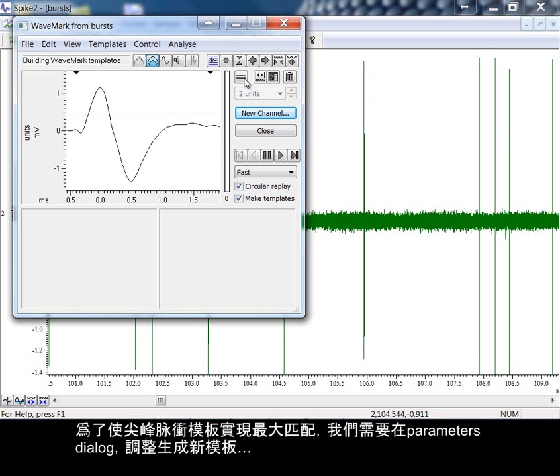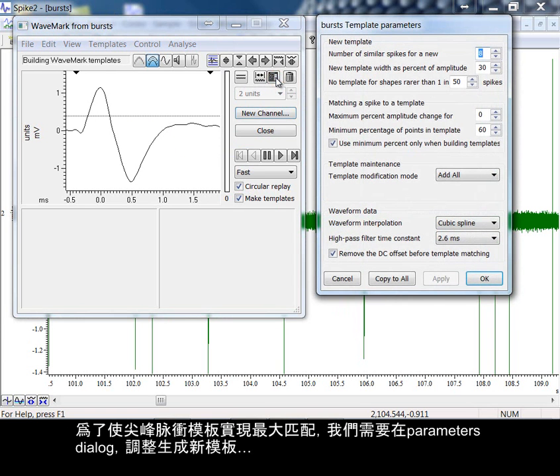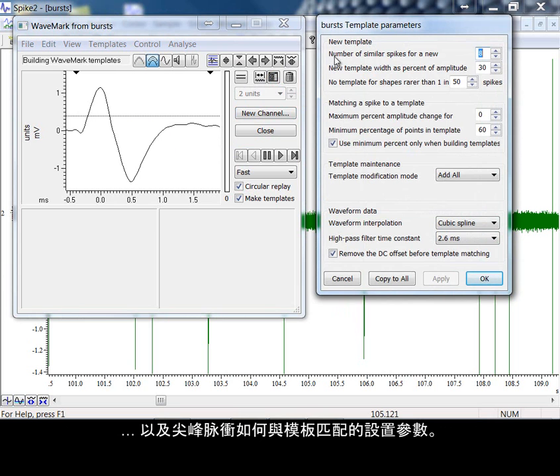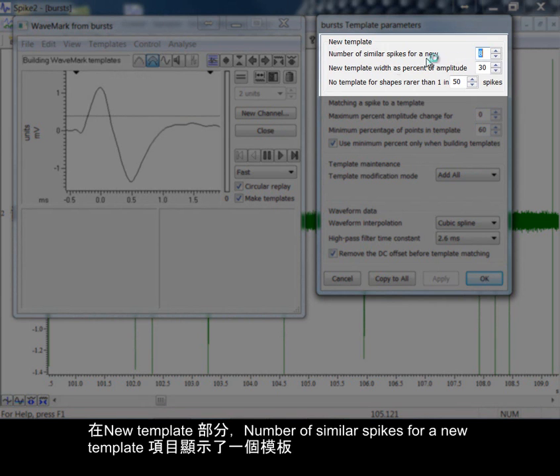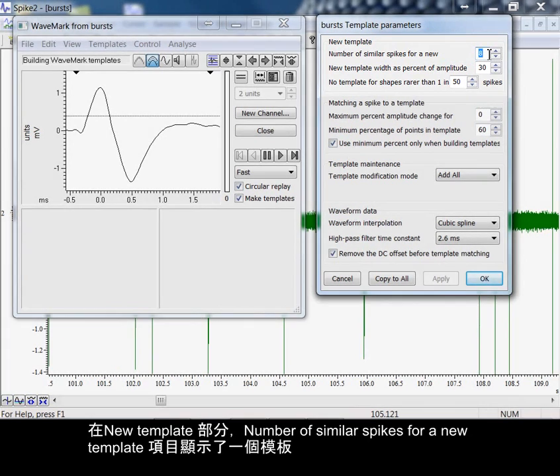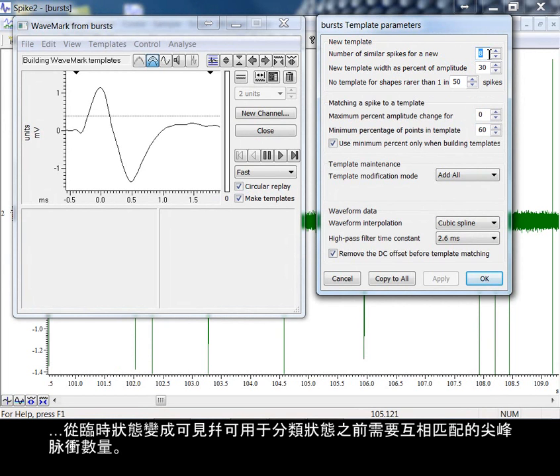To get the most out of spike template matching, we need to go to the parameters dialog here and adjust the settings for creation of new templates and how spikes match to these templates. In the New Template section, the item number of similar spikes for a new template dictates how many spikes must match each other before a template is promoted from provisional status to one we can see and use for sorting.